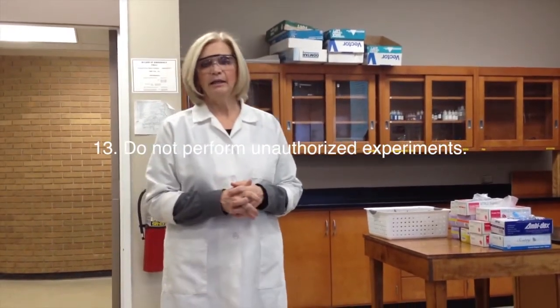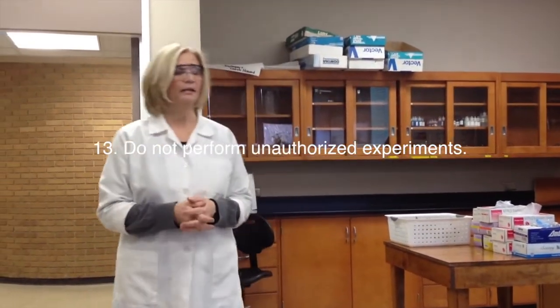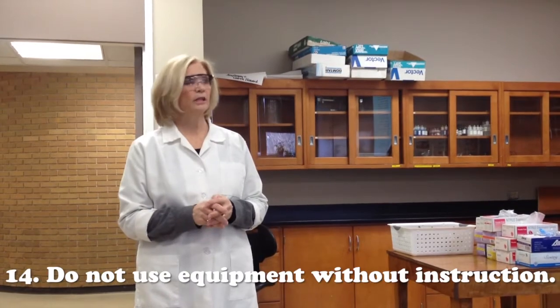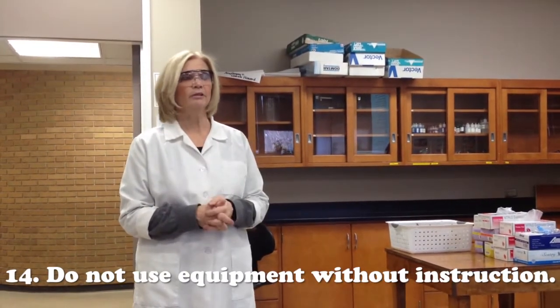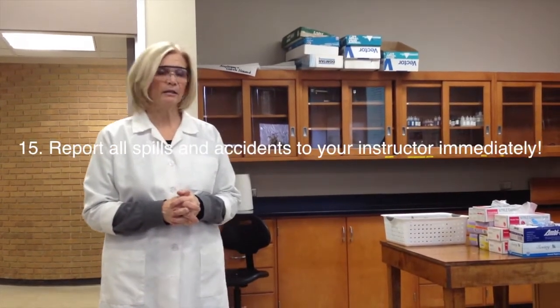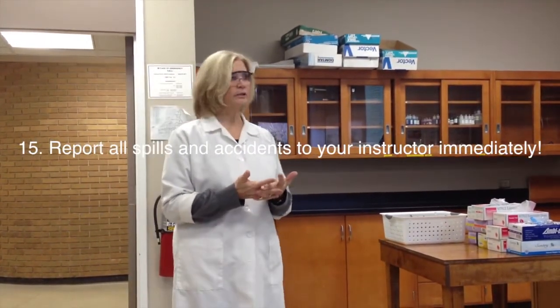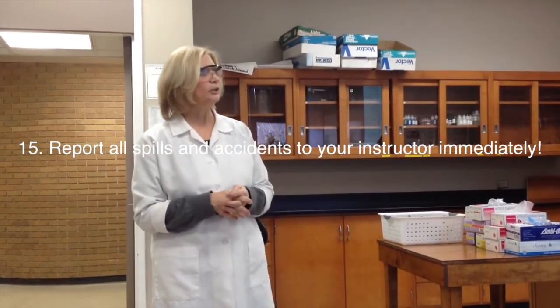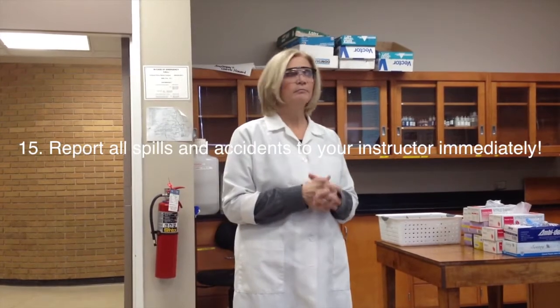You will have the experiment of the day that we're working on, and it will consume most of your time. Don't use any equipment without instruction. I will instruct you on every piece of equipment that we'll need for the lab that day. Any spill that might occur, please report it to your instructor. The instructor will clean up the spills and breakage at the time and prevent any further contamination.